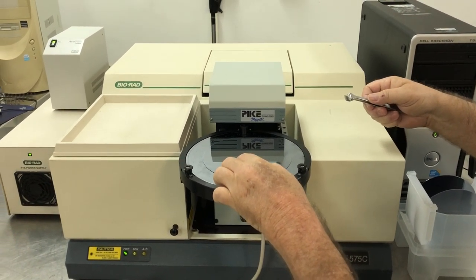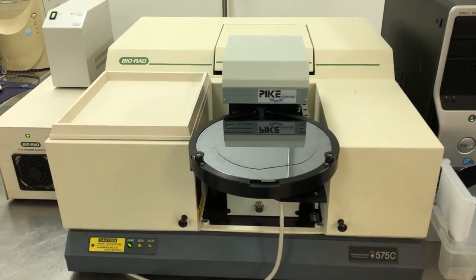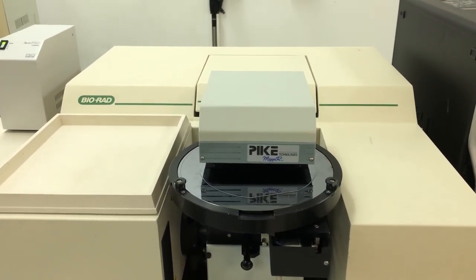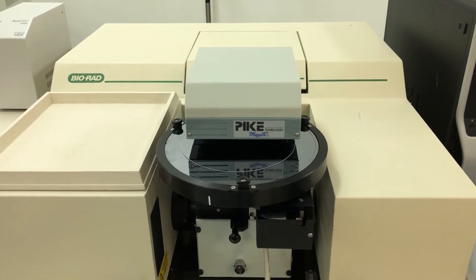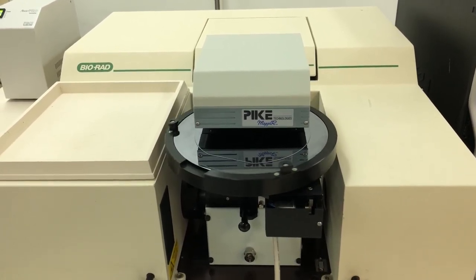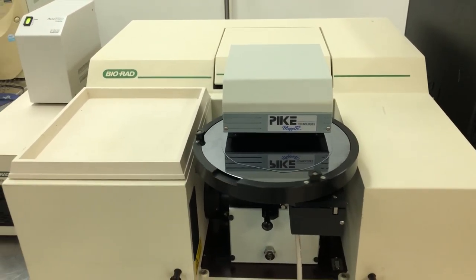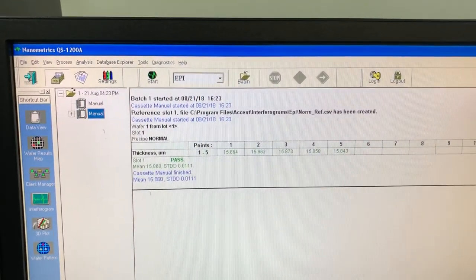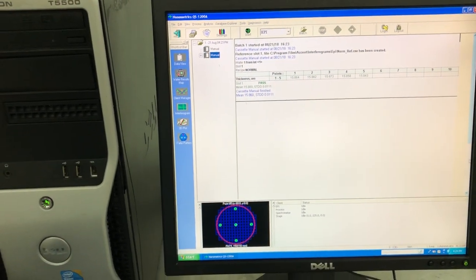We're going to be taking five data points. Watch the stage operate through the measurement. First point is the center. I'm showing you what it looks like. Here's the data — there's a map showing the test points.